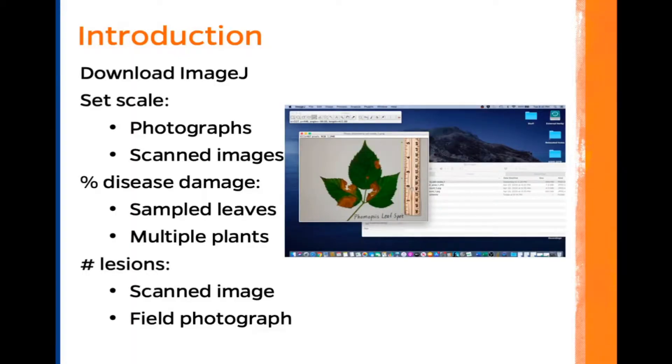This is the second movie in our series, and in this movie we are going to set scale for photographs.